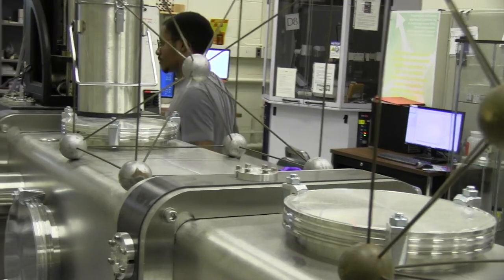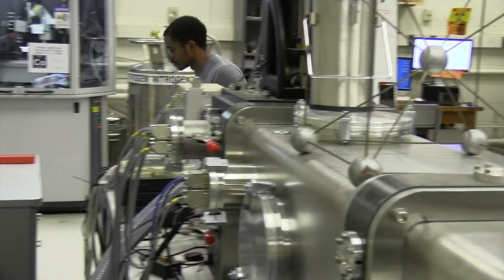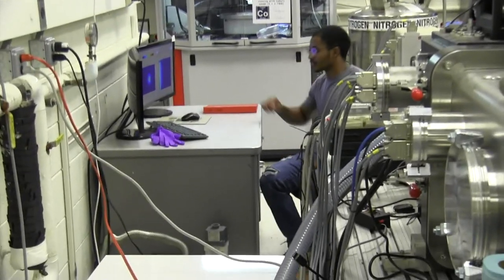The Materials Research Laboratory at MIT is home to the MIT Materials Research Science and Engineering Center, a National Science Foundation-supported program that enables interdisciplinary research, education, and outreach efforts.